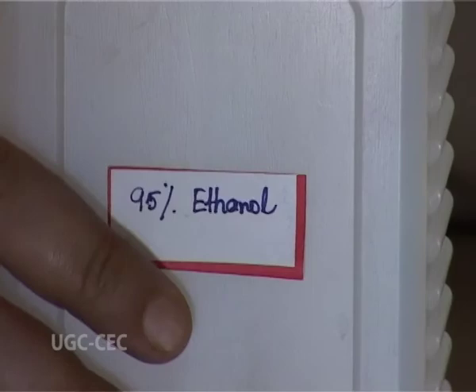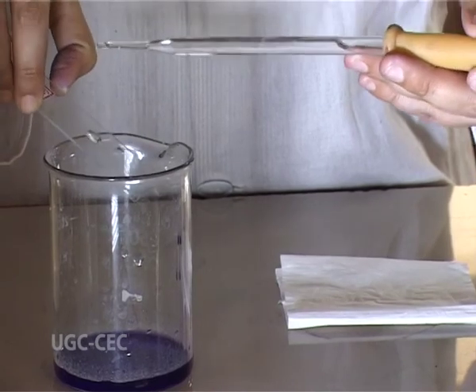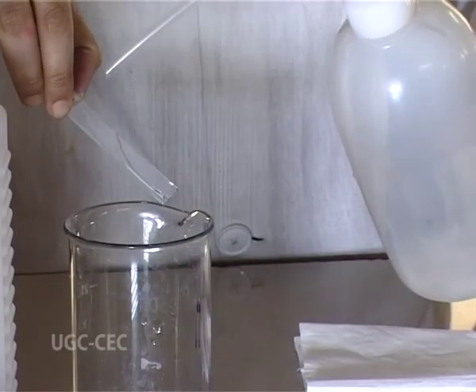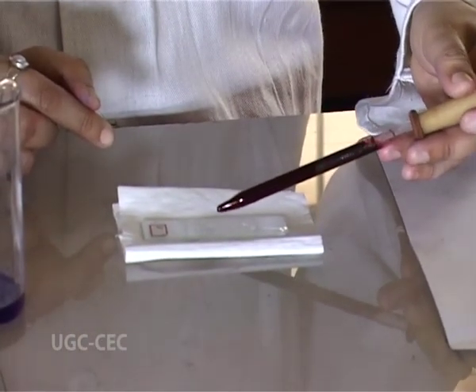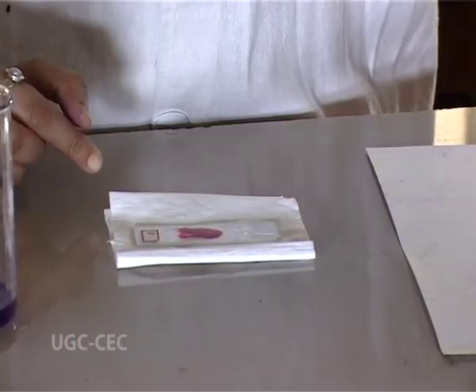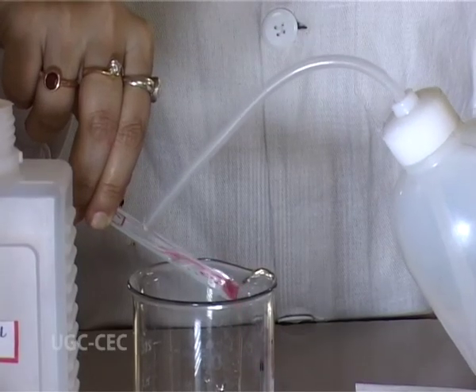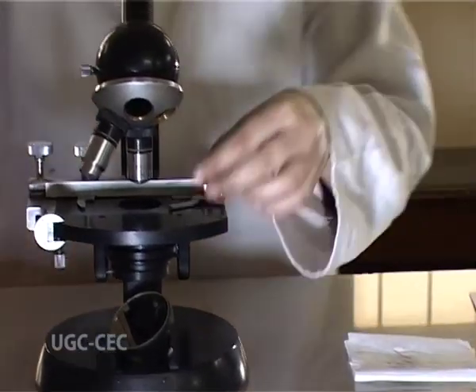the biological tissues. Now, after iodine is kept for 30 seconds, it is washed with 95% ethyl alcohol, until no color is given out from the smear. Then it is washed with distilled water, and then the smear is counterstained with safranin and kept for 30 seconds. After 30 seconds, the excess safranin is washed with distilled water. The smear is air dried and visualized under the compound microscope.